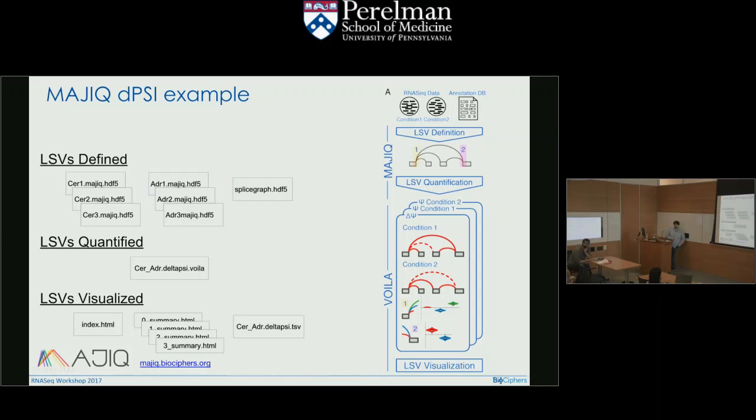Yes? We're using a GFF3 file. Yes. Input for the LSVs. Mm-hmm. Are you doing de novo as part of this workflow? Yes, so by default, de novo detection will be done, and I'll go over how that's done, but you have the option to turn that off, and we've got a slide on that. Obviously, that'll speed things up. But if you're including a GFF3, you're using those as sort of the starting point and then building. Exactly, yeah.